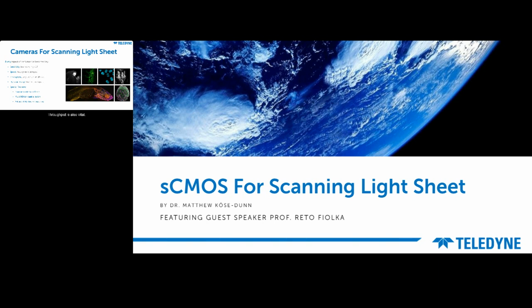Throughput is also vital. Light sheet is often used on larger samples. A camera with a large sensor will have a large field of view and a small pixel, which results in high-resolution imaging, especially if you match it with a suitable objective. So the combination of a very large sensor and a very small pixel will result in the ability to image large samples at a subcellular resolution at a variety of different magnifications.